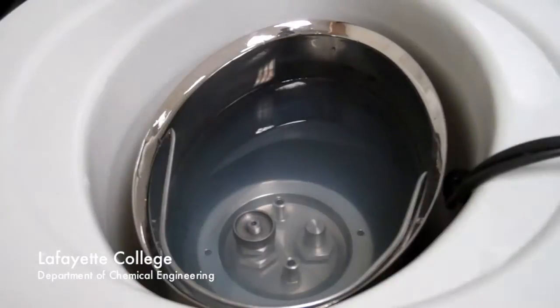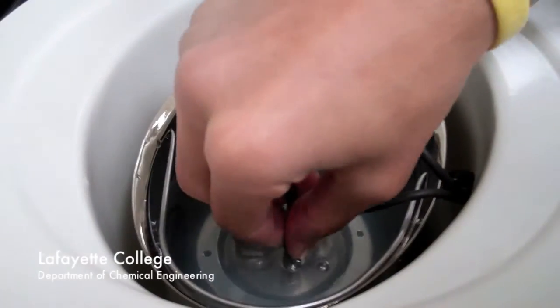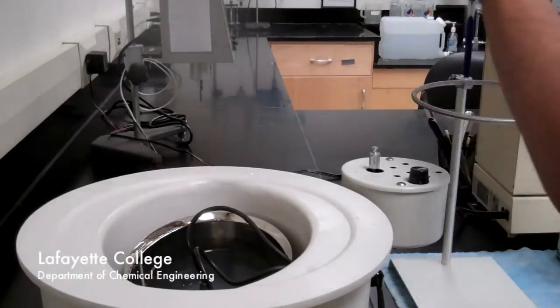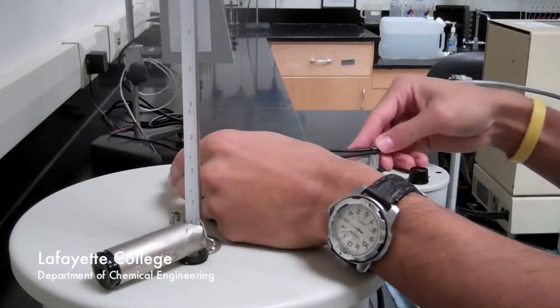Make sure there are no bubbles coming out of the bomb. If there are, you need to start over. Attach the ignition leads to the bomb, being sure to shake any water on your hands back into the bucket. Put the lid on the calorimeter, ensuring the stirrer is rotating freely. Then attach the stirrer to the motor and power it on.